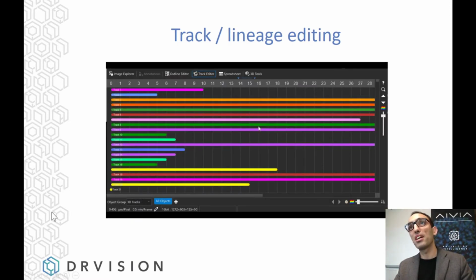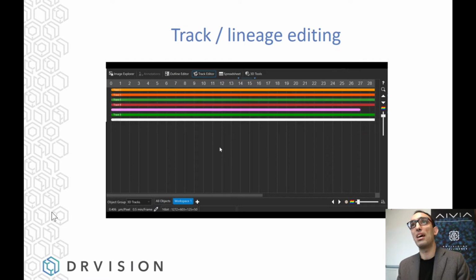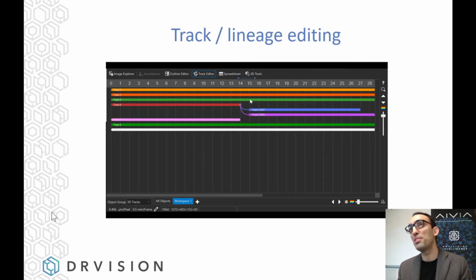So that's what it looks like. Little video with the selection. So I'm selecting there some tracks, and I'm moving them to a new workspace. You'll see there's a new workspace now visible. And the editing is very straightforward. So you just can click, drag, and drop. And if there is a question about what could happen, it will pop up, and you just click again to choose what you want to do.